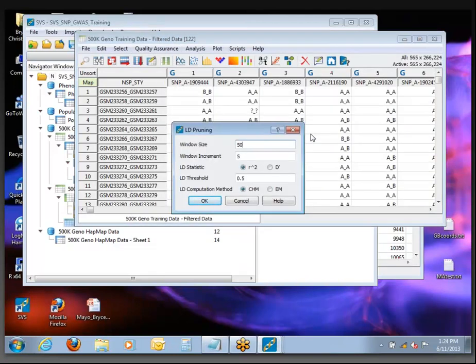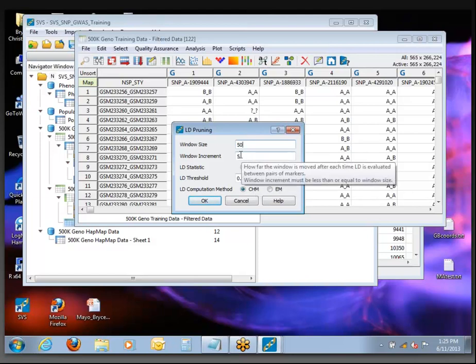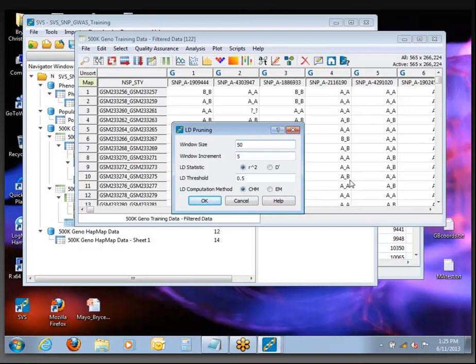The one we want is called LD Pruning. The default options: it takes 50 SNPs at a time, checks through those 50 SNPs looking for any pairs that are correlated with each other, and if it finds any it will drop one out, then slides five SNPs to the right and does the same thing. Just to make this go a little bit faster, we're going to use a smaller window — setting it down to 30 — and the window increment we'll set at 15, so it will look at a smaller window and take a bigger step.